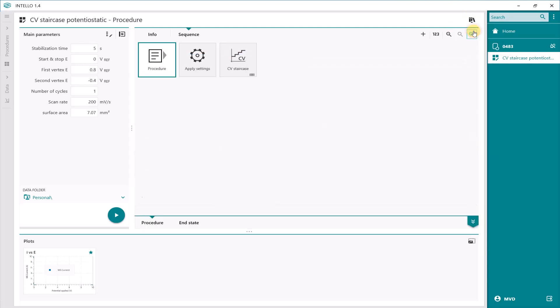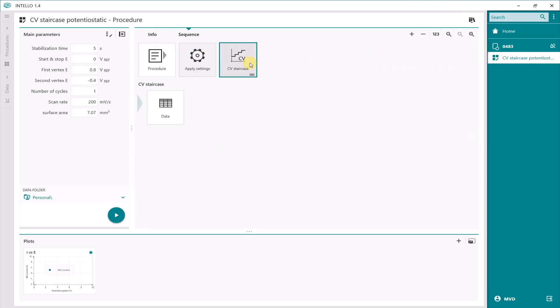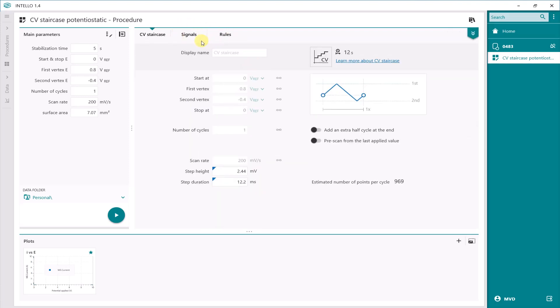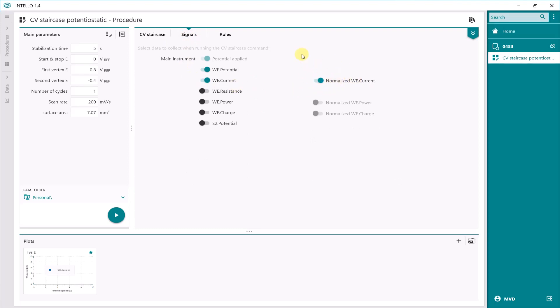Now we go to the CVStaircase command. In the signal type of the CVStaircase command, you can see the normalized current, which is already enabled in the signal sampler. You can also do this for the charge, and the normalized charge with respect to the surface area is enabled automatically. You can deselect these, but we are only interested in the current at the moment and we want to measure the current density.